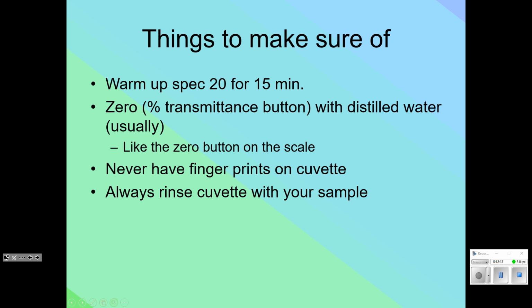Now, if I had water in here to zero it, and I dump out my water, and then I put in my blue solution, if there was a couple of drops of water still in here prior to adding my blue solution, I just watered down my blue solution. Does that make sense? Little remnant in here, now you add.